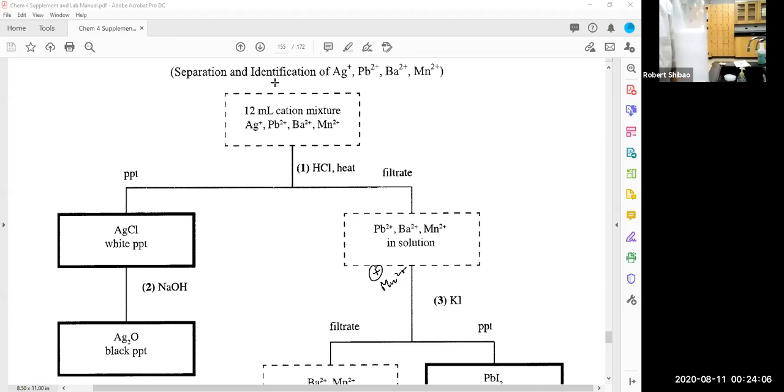And so what I have to do is wait and let the precipitate settle a little bit and then check it. But there's another thing I can do as well, and I have to do this anyway, which is heat it. Heating it helps coagulate the crystals so that they grow bigger and sink faster. And so I'm just going to go ahead and start heating this.